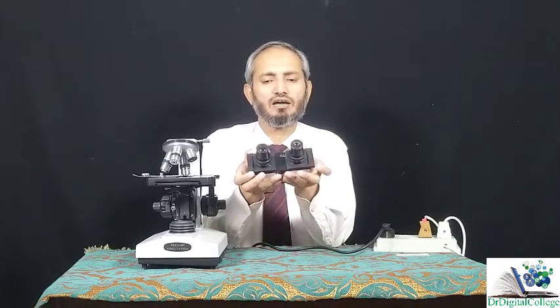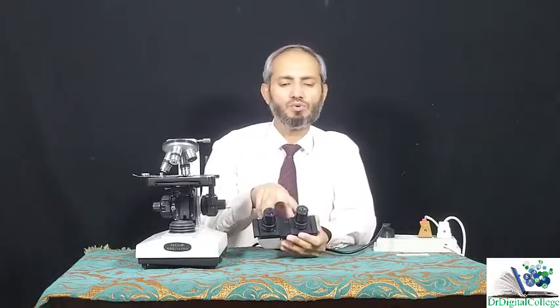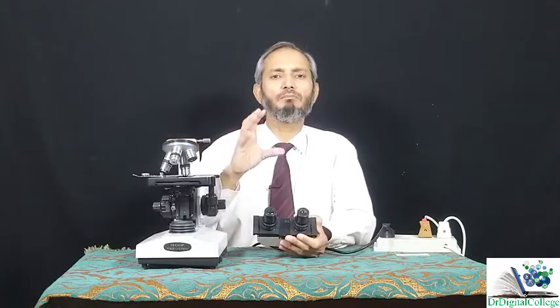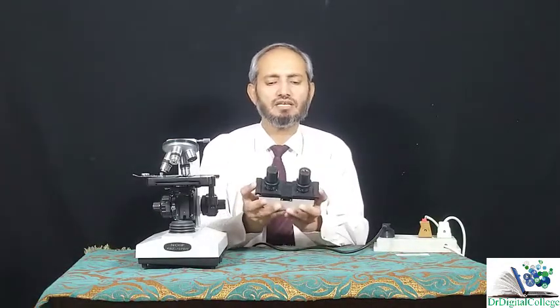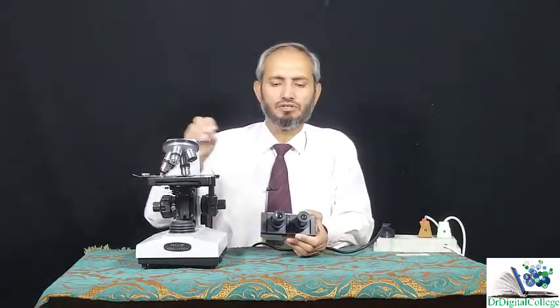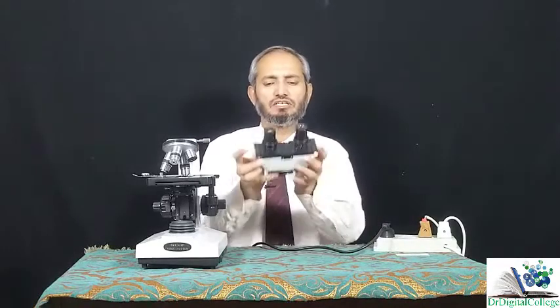Look at this. This is the diopter. I can increase its width, or I can decrease its width. It is called a diopter because it has two optics in it: this is one, this is two. That's why this microscope is also called binocular, because we use both eyes while observing certain objects. So this here is binocular. While you are observing something, you have to adjust the width of this diopter according to the width of your face. Somebody has a broader face, others have a less broad face, so you can change the width.